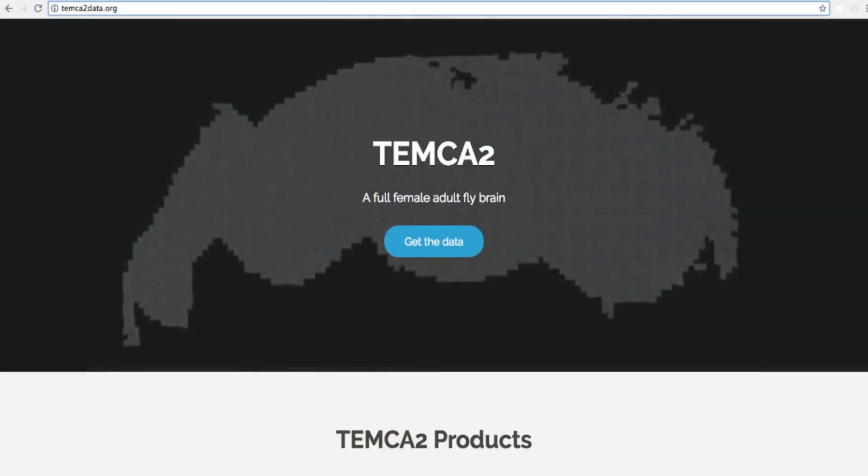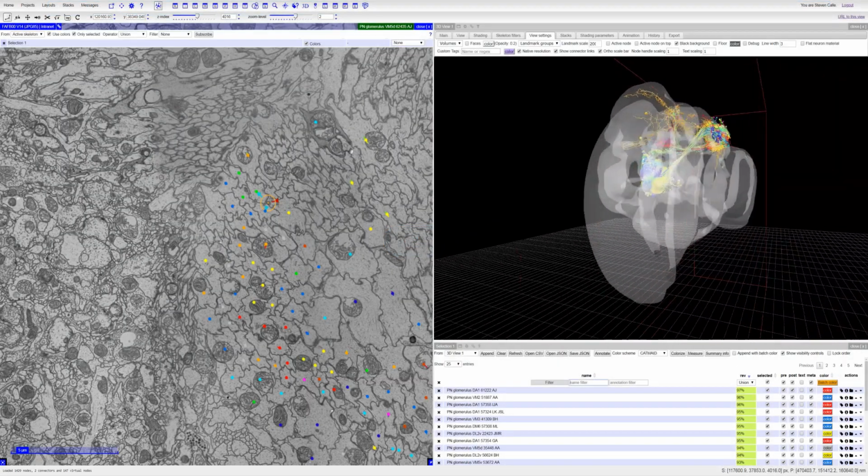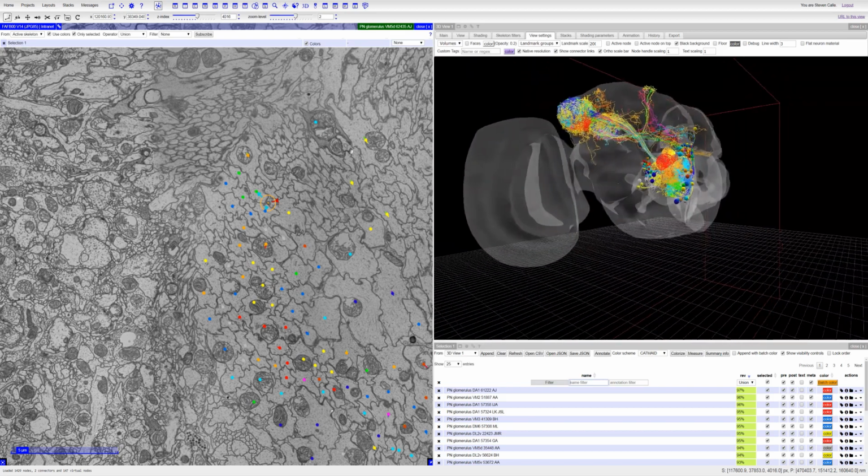by working with our scientists to reconstruct neural circuits in many different areas of the brain. Additionally, we are providing a pre-configured tracing environment that includes the CATMAID tracing software, the neurons presented in this manuscript, as well as scripts to download the entire EM volume. Scientists can trace any areas of interest to them and use import-export functions built into the CATMAID software to share traced neurons across laboratories.